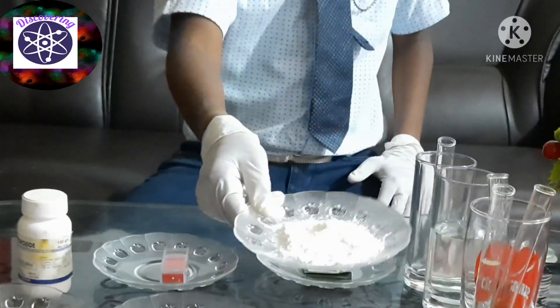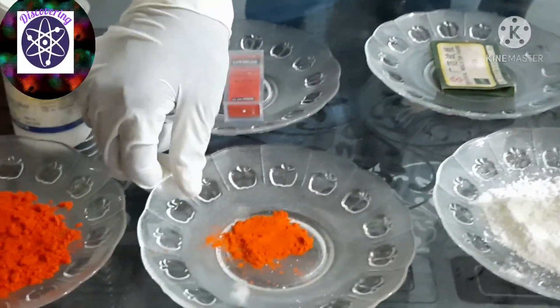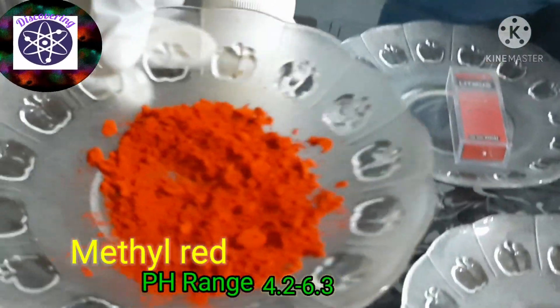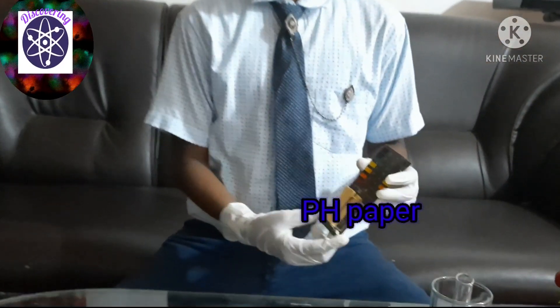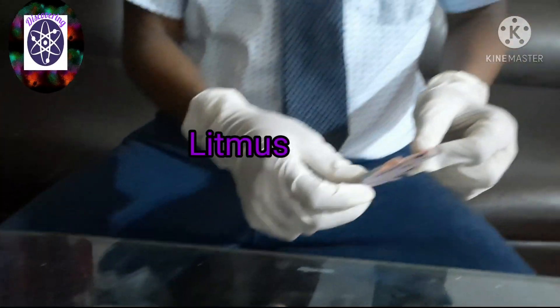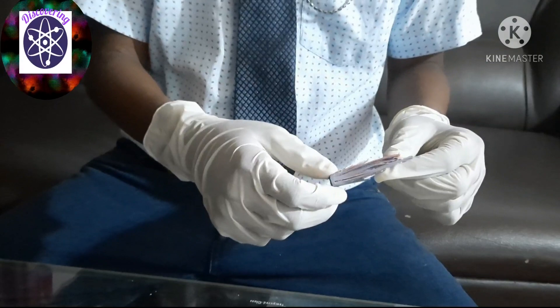I have taken some indicators which are used in the laboratory, such as phenolphthalein — it is a kind of powder and the solution is colorless. Methyl orange is an orange color powder. Methyl red is a red color powder. Peach paper is a kind of yellow color paper in strips. Litmus is used to test the pH balance. There are two types of litmus: red color litmus and blue color litmus.